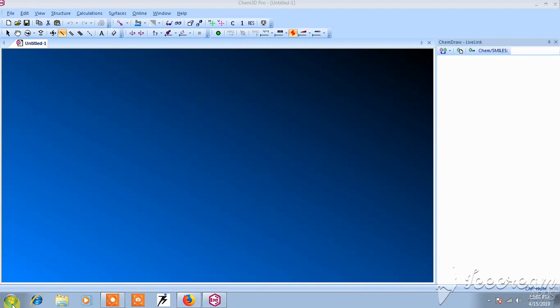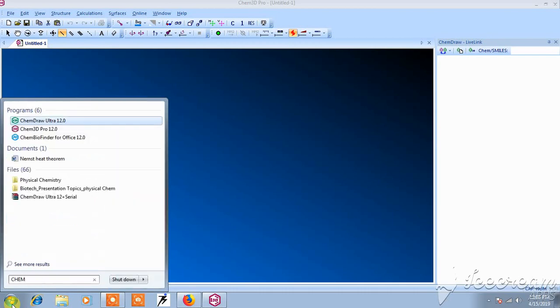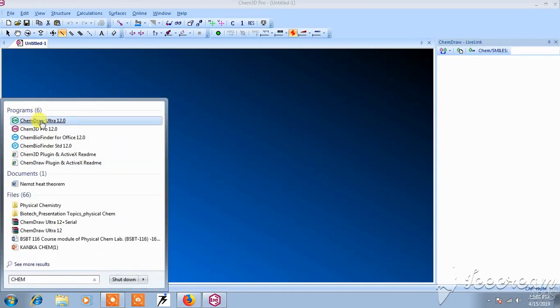First of all, just go to the taskbar and open ChemDraw Ultra.